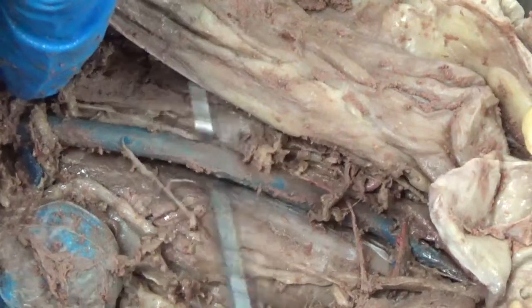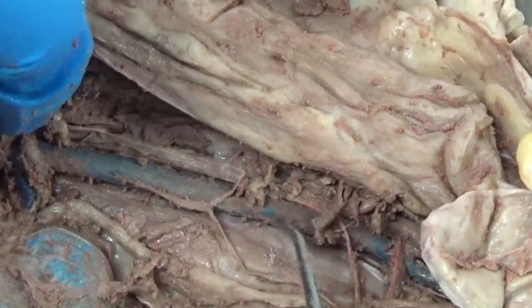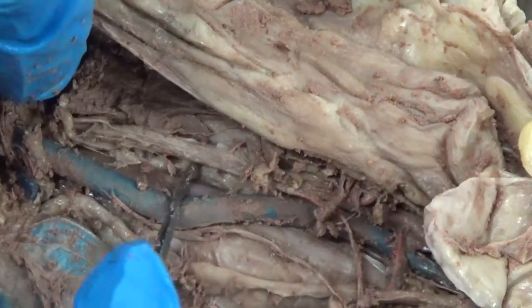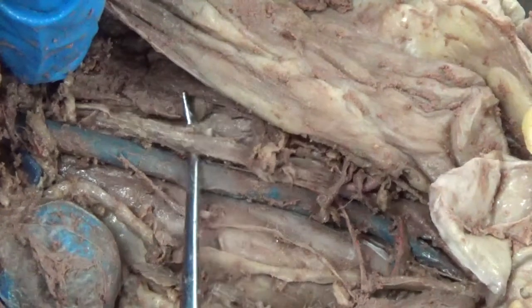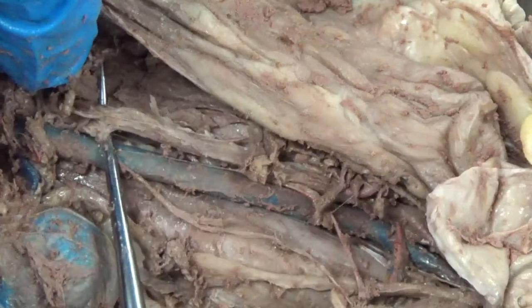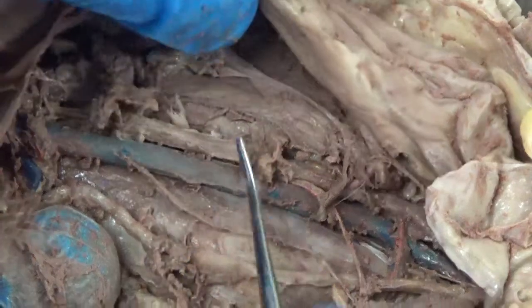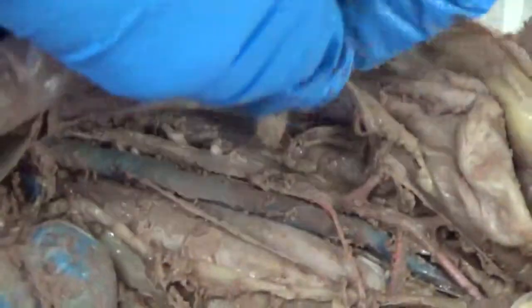In humans, we would call it the inferior vena cava, and it runs the whole length of the abdomen, and it carries blood back up to the heart. Located behind it, this structure right here, it's hard to see because it's got a thicker wall, but it has pink latex in it. This is the abdominal aorta, so this is carrying blood away from the heart down to the lower extremities and the leg.